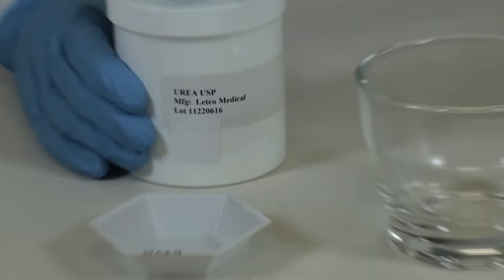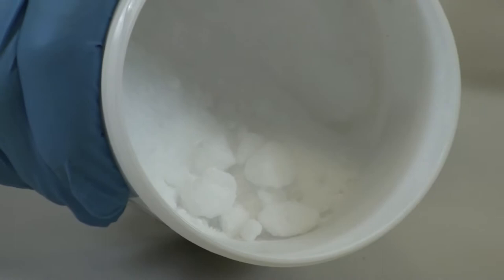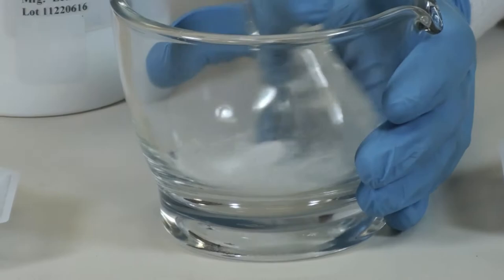Urea comes in a crystalline powder, and when you make a cream, you want your powders as fine as possible before you incorporate them into the cream. So retrieve some urea from the supply station and place this powder into your mortar. You will now want to triturate it with the pestle until it's as fine a powder as possible.